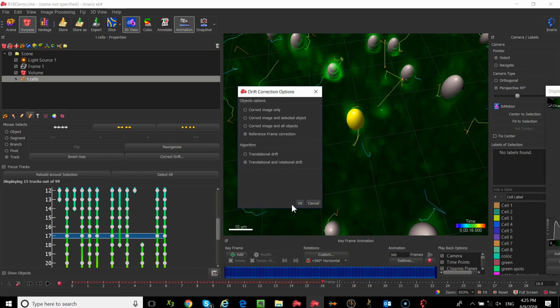No? Oh. I don't know how to add spot. How to add spot when I label spot and then we connect as a tracker, but in maybe the first 2 steps we can add or delete. So I'm going to come and help you in just 1 second, okay?